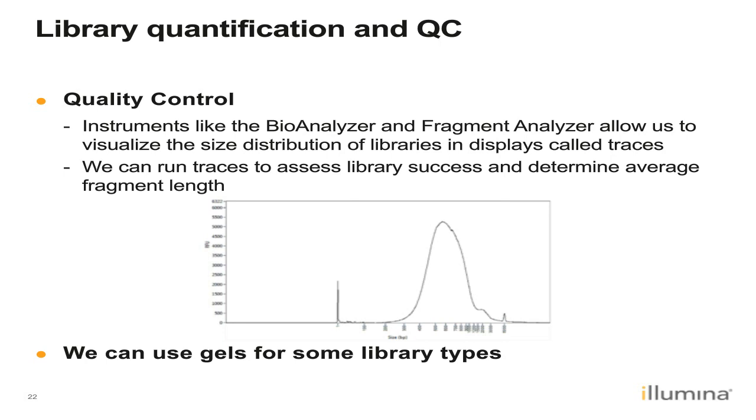We periodically have a webinar for library QC and troubleshooting with the Bioanalyzer. This webinar is super informative, and I do encourage you to attend if you would like additional information. If you have questions about library traces or would like to review them together, please feel free to reach out to tech support.